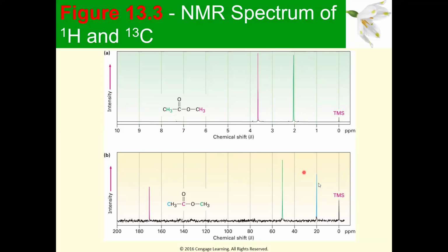All right. So one other thing to point out, and this is the only thing we're going to say about carbon-13 NMR, because you notice that we run this sample, you run the proton NMR spectrum, and then you could also run the carbon-13 spectrum. So notice two things about it. First of all, the scale is different. Instead of going from 0 to 10, it goes from 0 to 200. So again, that x-axis depends on what nucleus you're analyzing.